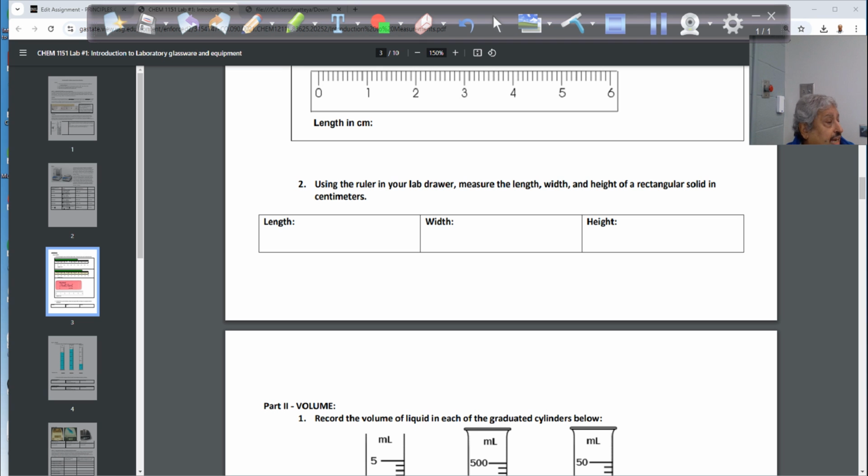No, I can't say, because you have to measure, and each object is different. One object will give you 2 sig figs, one object will give you 3. I don't know. It depends on the object dimensions. So you can't tell up front. You have to measure it and see.